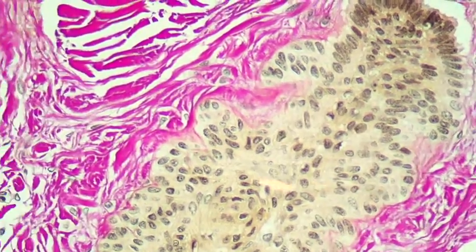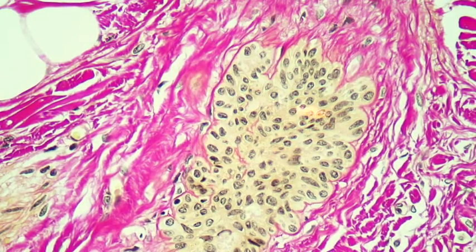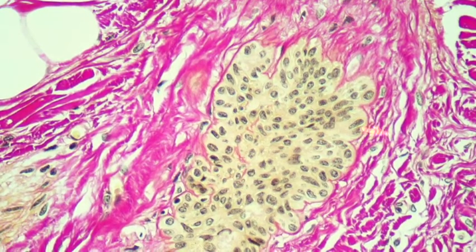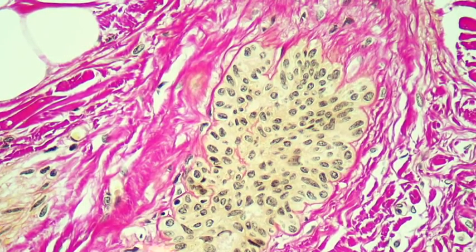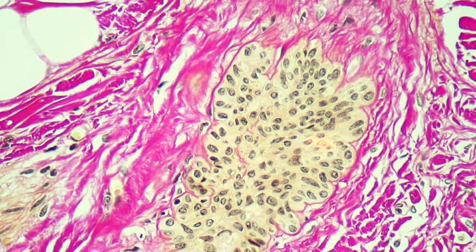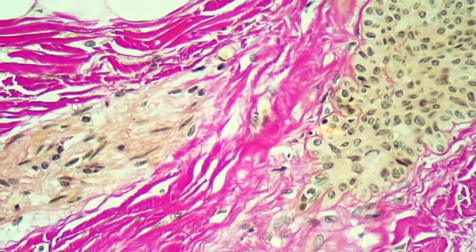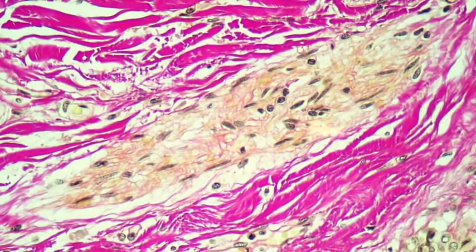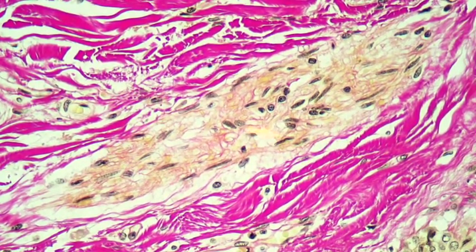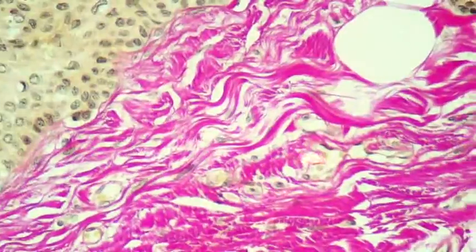Looking at the skin section under the microscope, there's a clear junction between the epithelial cells and the surrounding collagen fibres. The nuclei are nice and dark, which is great — that's the result of just that single dip in the acid alcohol. Very good separation with picric acid staining the keratinocytes yellow and red to pink in the surrounding collagen fibres. There is also some smooth muscle here staining similarly to those keratin-rich epithelial cells — essentially yellow.